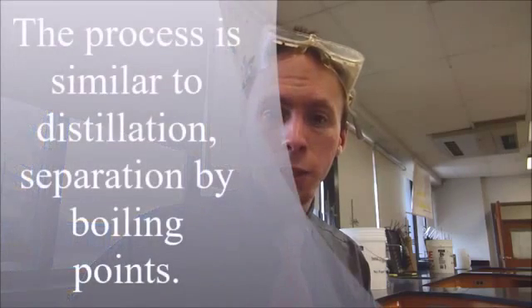Last semester we did a series of labs that were separations, and we took advantage of the physical properties of the different components of a mixture to separate the mixture into its component parts. We're going to do another separation as well, related to one which we call distillation, which is a separation by boiling point. But it's not exactly the same as that, but it's the same principle.